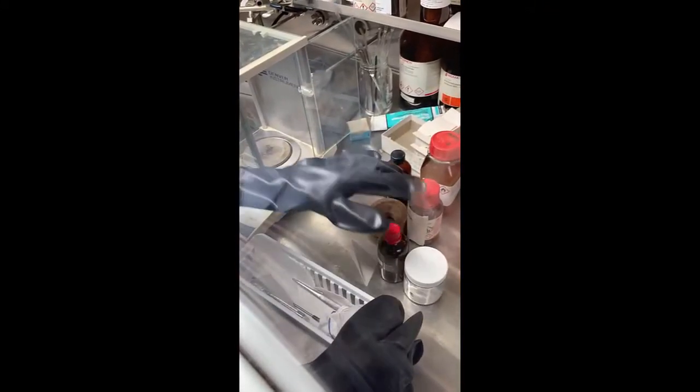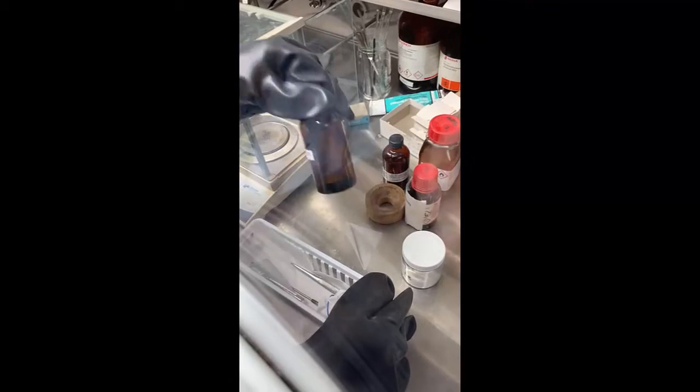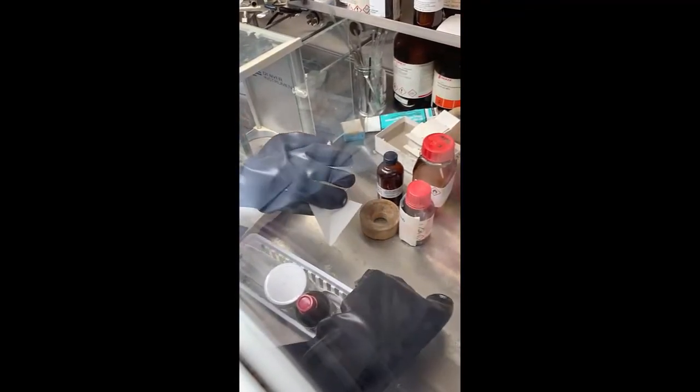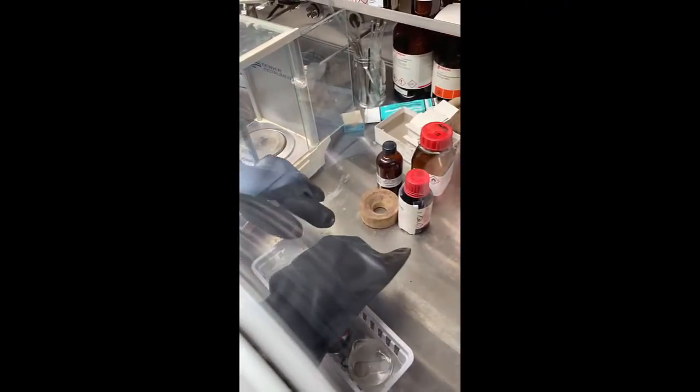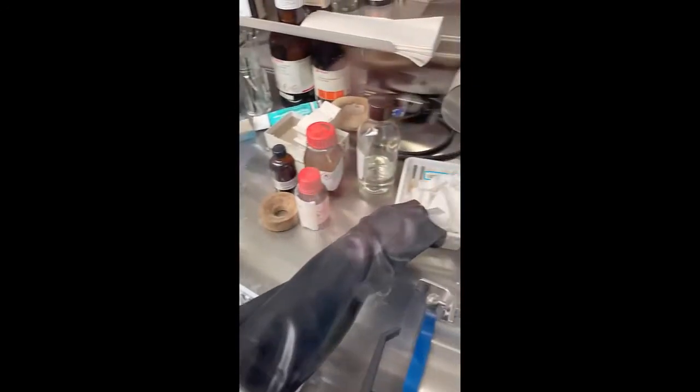Then, place everything that you brought into the glove box back into your bin. Make sure that any chemicals that you brought in, including solvents or solids, are back in your bin. Anything that was in the glove box when you started can remain in the glove box unless otherwise stated. And also, be sure to remove any garbage or trash that you generated while in the glove box to keep it clean for the next people to use.